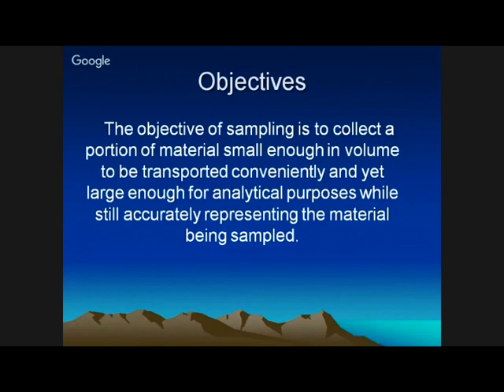And how much sample you have to collect also depends on how many parameters you are required to analyze. If you have to analyze 5 parameters, accordingly you will take 100 ml or 1 liter samples. If you have to analyze more parameters, then you have to collect more sample, and accordingly you have to decide whether to collect 1 liter, 2 liter, or 5 liter of sample.